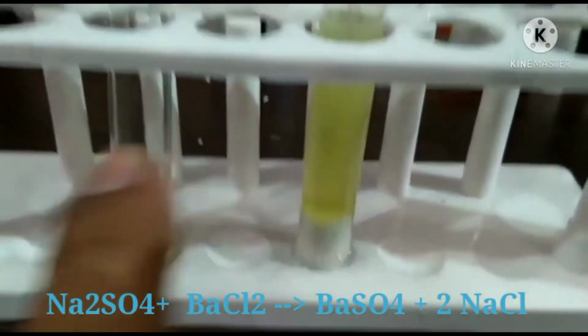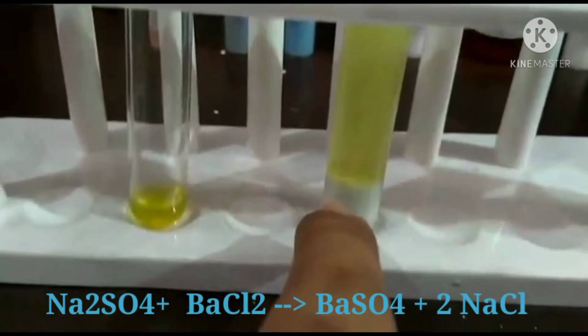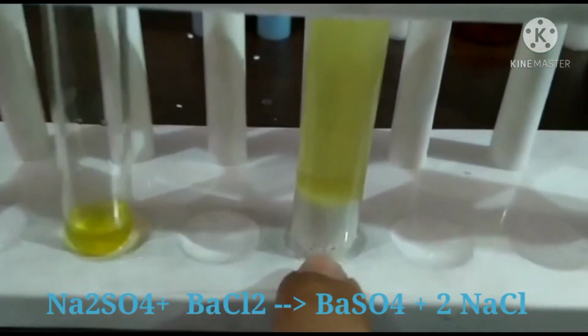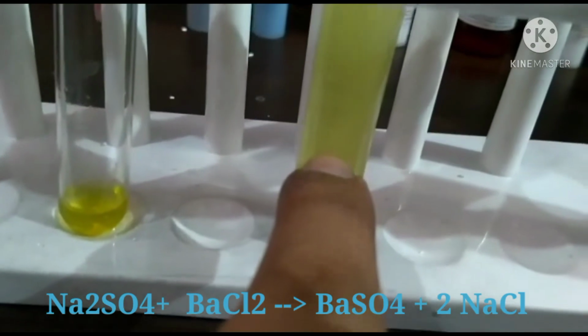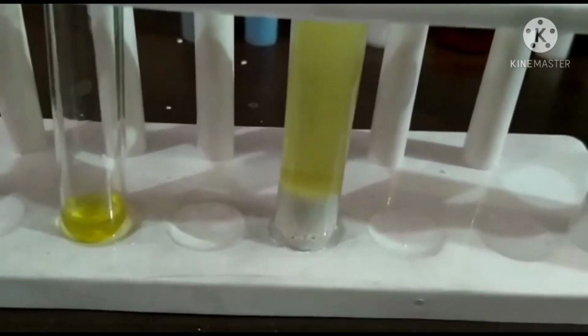Actually we have taken sodium sulfate first. We have added it to the barium chloride, and a double displacement reaction occurs. At the bottom we observe barium sulfate forming, which is the white PPT. In the upper part we observe the formation of NaCl, sodium chloride. This is the double displacement reaction.